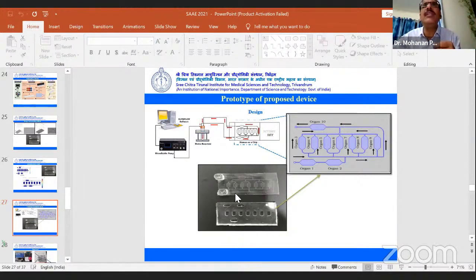And if you want to check the capacity, the potency, the efficacy of your flow or the liquid, you can take 20 microliter of this fluid, then you can check the pH and whether all other nutrients are there or not, very well daily. Like that, the same well or the same device, you can keep for 7 days to see its repeated dose. Or in a single day, you can expose 3 to 7 hours and see its cellular growth and its other potency and all.